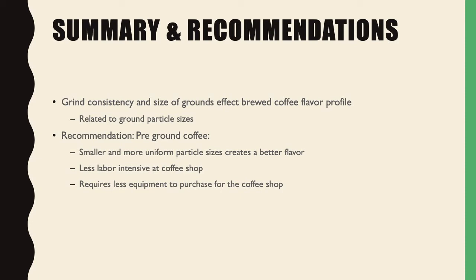The overall problem that we are attempting to solve is deciding if pre-ground coffee or self-ground coffee will result in a better flavor. Per our results, we recommend to use pre-ground coffee since it results in a more consistent particle size distribution. We determined this by testing the sizes of the coffee ground particles and by testing the amount of force it will take before a coffee bean will rupture. As stated before, if self-ground coffee is preferred, the maximum stress of the coffee bean should be taken into consideration when selecting a coffee grinder.